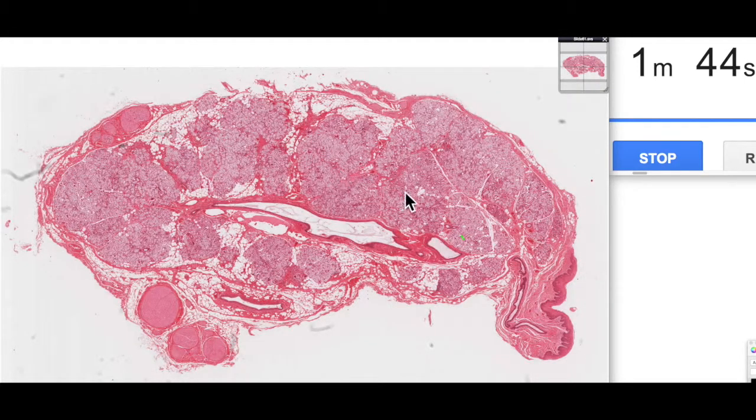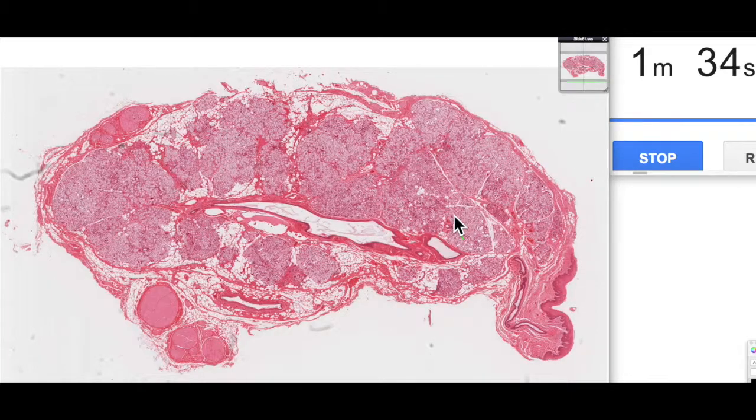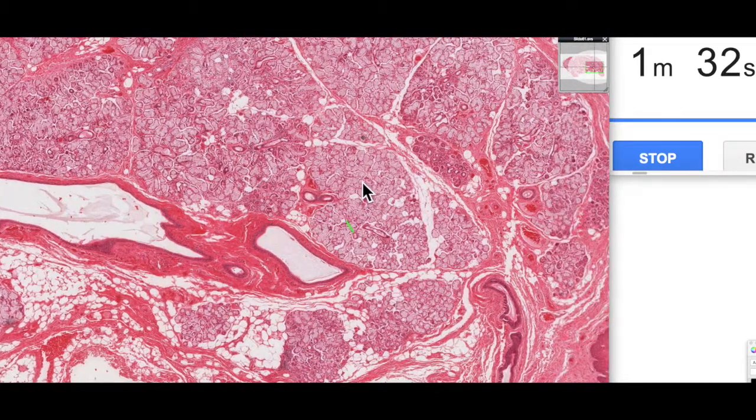Another area, as I mentioned, where we find it is in ducts of exocrine glands. So this is a section of the sublingual salivary gland. It sits beneath your tongue. These are all the secretory acini, and these are actually mucus acini.